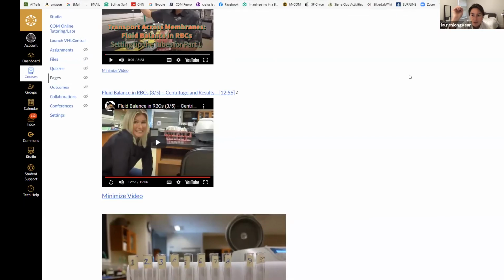Okay. I have a quick question about the test tubes. Did they say that test tube 6 was the urea when it was labeled the sucrose in the lab? Yeah, something got a little off for me too when listening to it. So say that again. I think test tube 6 and 7 were mixed up in the experiment that you guys taped. I think you said 7 was sucrose. In our lab, it says it should be urea.